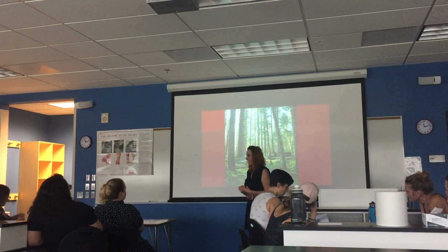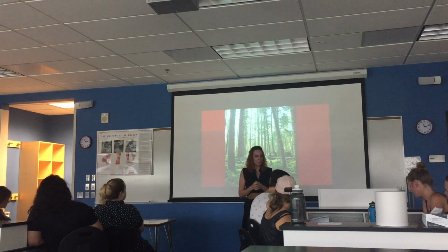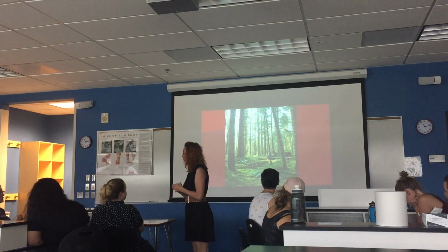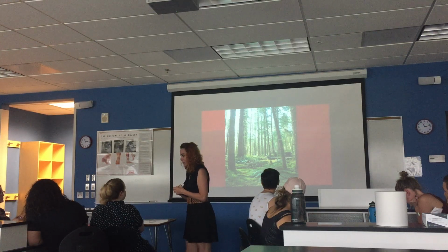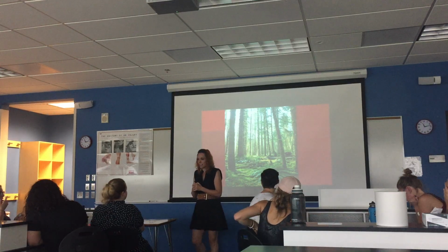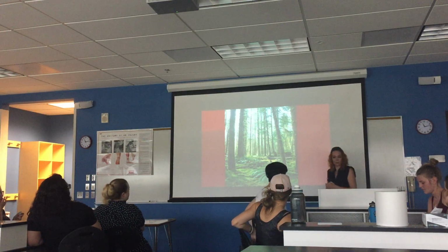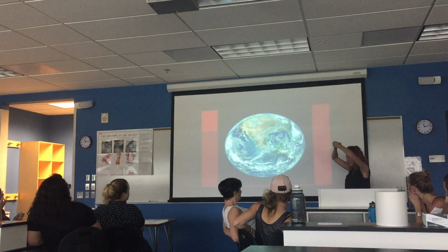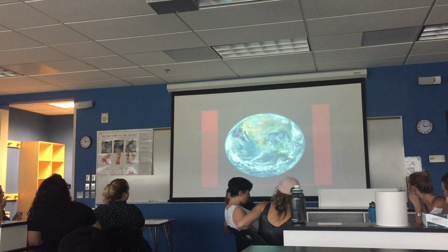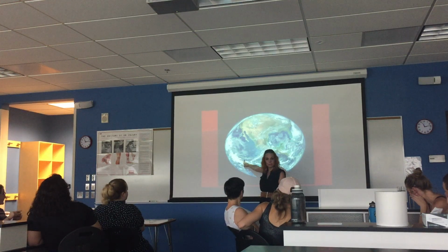Now you're landed on the planet, at 40x, and hopefully, if you flew your airplane, you started at the space station, and then you flew your airplane over a place that looked like a forest, and then you got out of the airplane and started walking around, you're going to be amongst trees, and you're going to find the trees. But if you are standing there and you're like, oh my God, I don't see a chondrocyte or whatever, and I come over there, I'm always going to tell you, if you can't find what you're looking for, go back to the space station, go back to 4x, and look around a little bit and make sure that you're not drilling all the way down when I come over and you're at 40x way over here, because you're never going to find the trees over here.